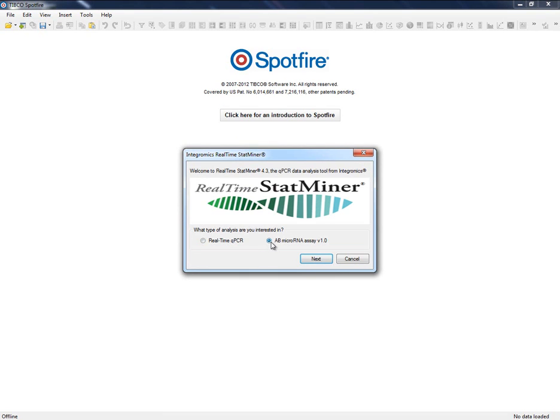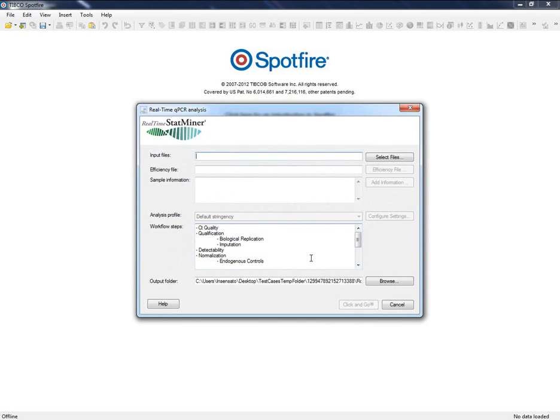First decision that we need to take is the type of the workflow that we want to execute. This is a custom analysis focused on the applied microRNA version 1.0 cards. For any other analysis, it is recommended to run the real-time qPCR workflow.